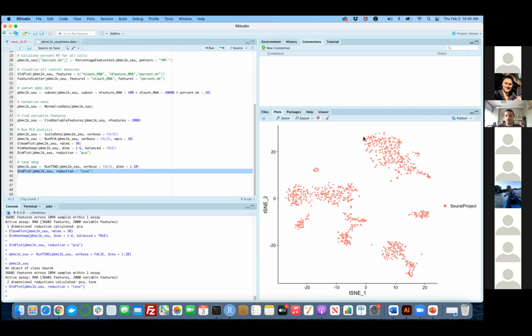Do you think this is one cluster or two? I think it's 2. You think it's one? Yeah, okay. Who's saying that? Bruce? Okay. So yes, the definition of cluster is really interesting here. A cluster is basically a group of cells that are closer to each other, right? But from what perspective? So I'm going to disagree with Bruce here.